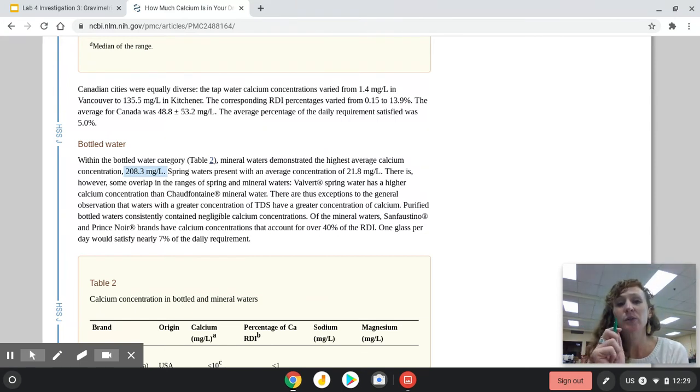And you're going to want to use that and calculate out how much sodium carbonate you need to add in order to precipitate all of that. And then we're going to assume that our amount of calcium in our water is less than that amount. Or you can do the 4 different trials and you can just do some guess and check and see when your results stop increasing. Either way, make sure you include it in your procedure.